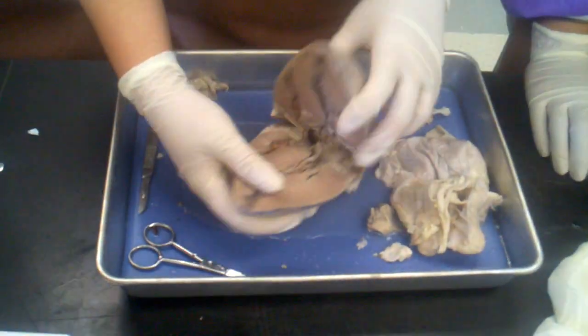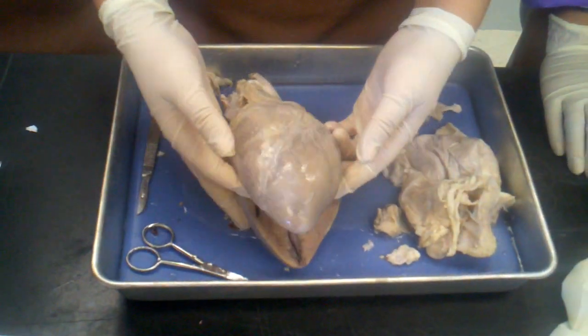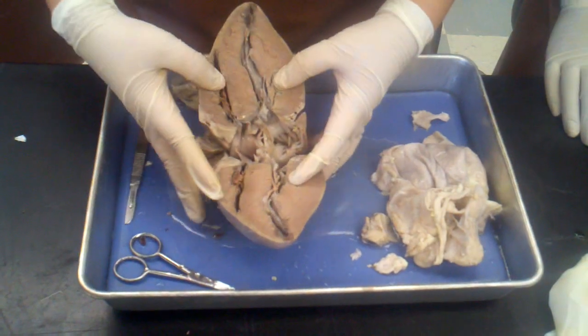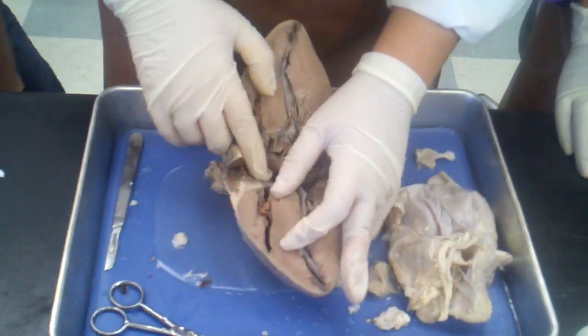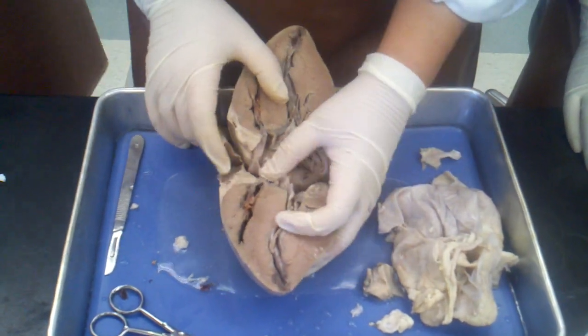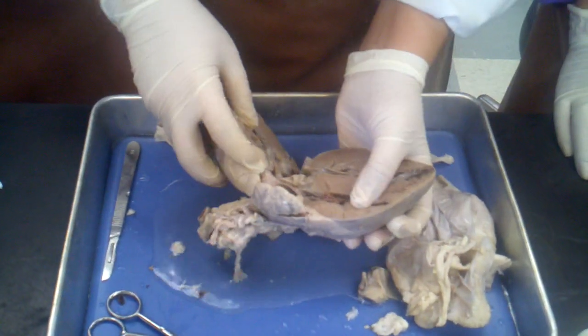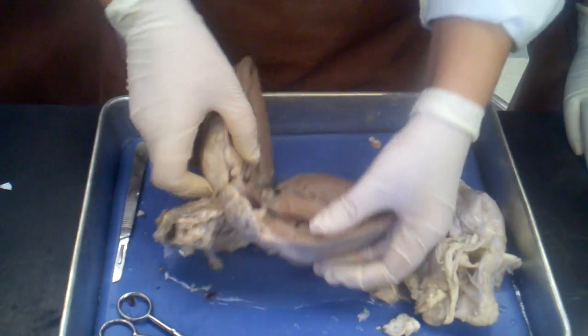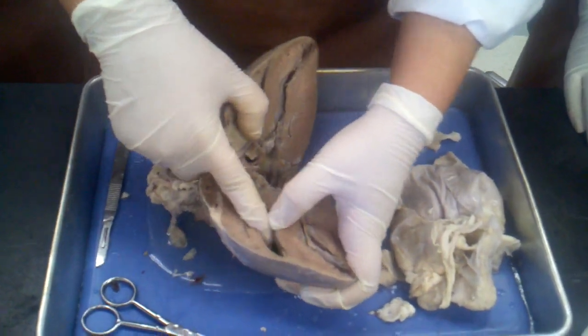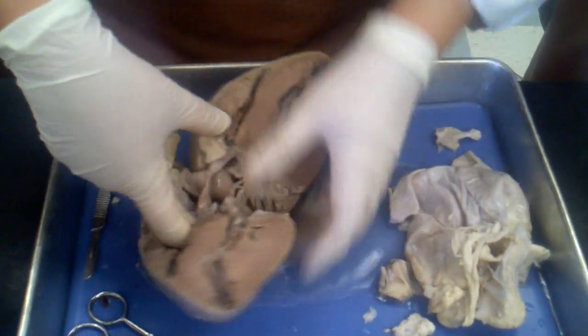All right, so here's the heart. When you open it up, here's the right atrium in here. Check it out! Here's the right atrium, and then here's the right ventricle.